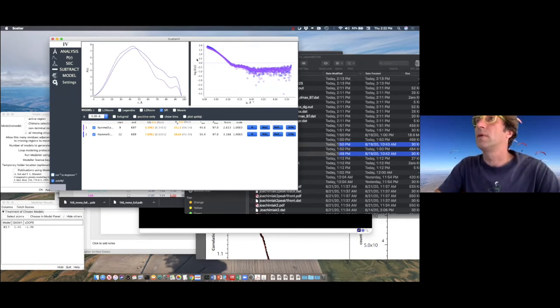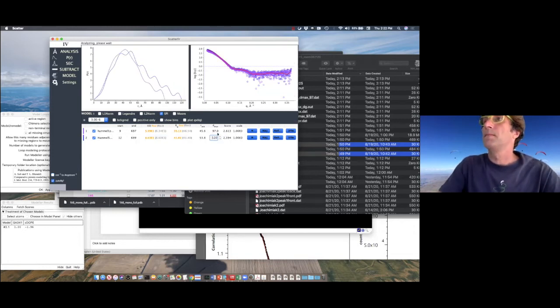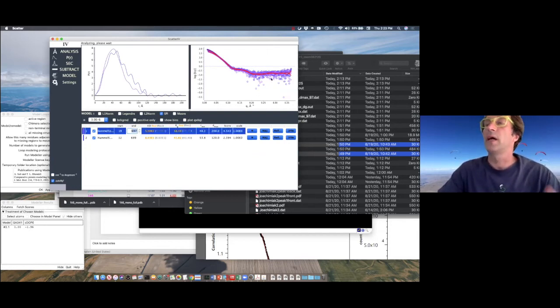Obviously, there are some issues from the beginning. Rob showed you how to define the Dmax automatically. I'm kind of an old school guy, and I truncate the data. I think there was a question of how much you can truncate. From the Qmax, if you calculate the pair distance distribution function, I really recommend you truncate to about 0.3. That's for most of the pair distance calculators, be it GIFT or GNOM, or any type of method that Rob is using here in ScÅtter.